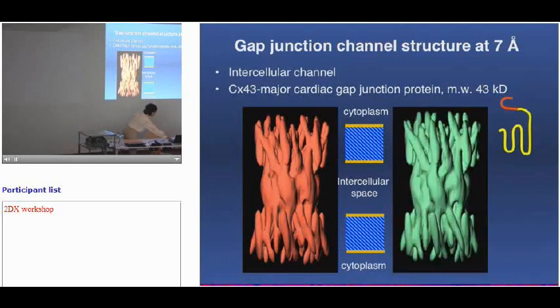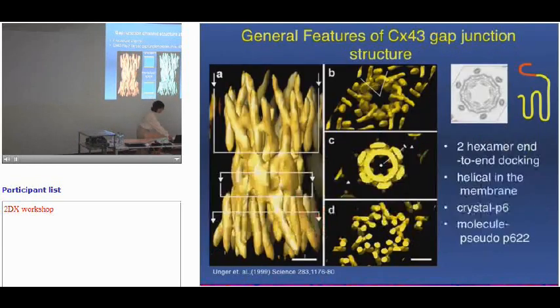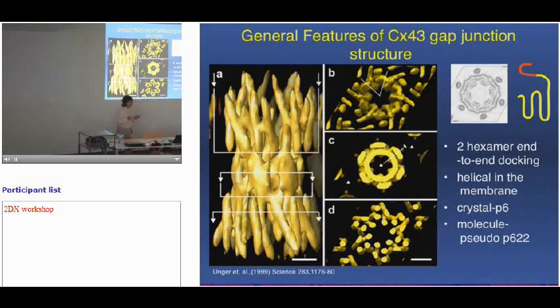So I got 2 maps. Of the 2, they look pretty much the same. So I've been wondering, what am I going to do with this? I can see from my lattice lines there are some small differences, but they are not big enough to account for the whole mass. So there are some other things that changed, despite the fact that I cannot see the C-terminus in the map. The reason I want to show you this is because there are some tasks that I ended up doing in 3D that use a certain property of this particular protein.